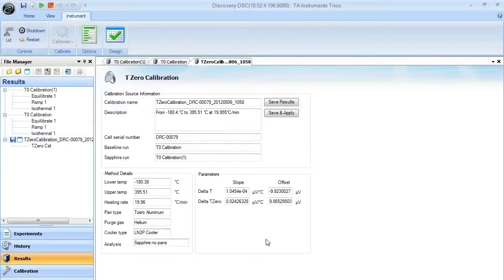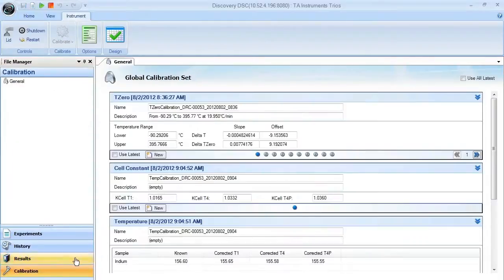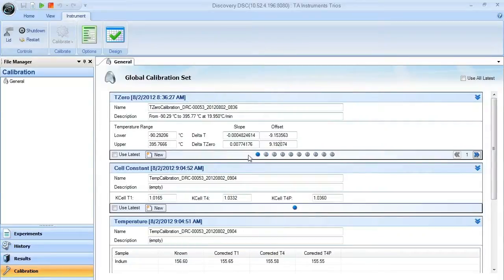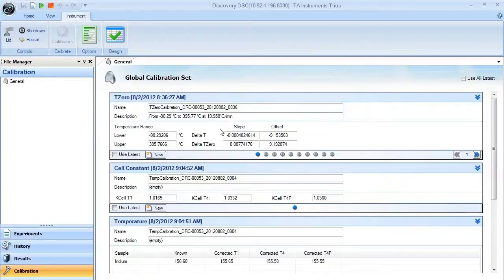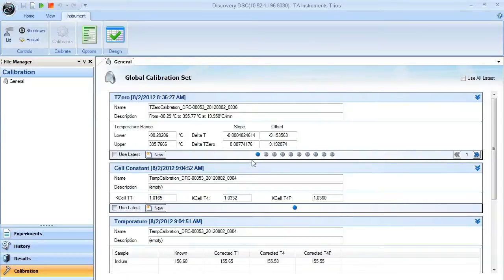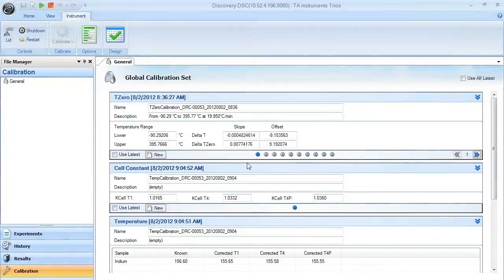When you feel that these parameters are correct, you can simply hit save and apply, and those items will be saved in your T0 calibration set here and can be selected at any time. Once you do this, you're looking to calibrate the remaining portions of your DSC, and after that you're ready to run some experiments.